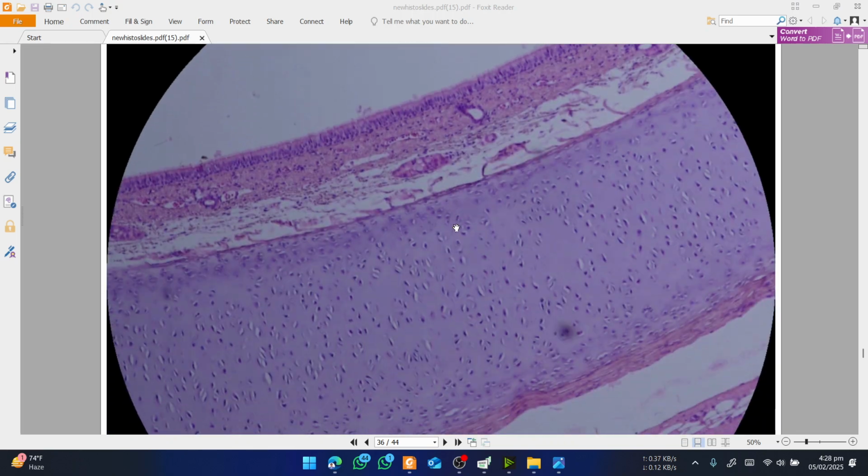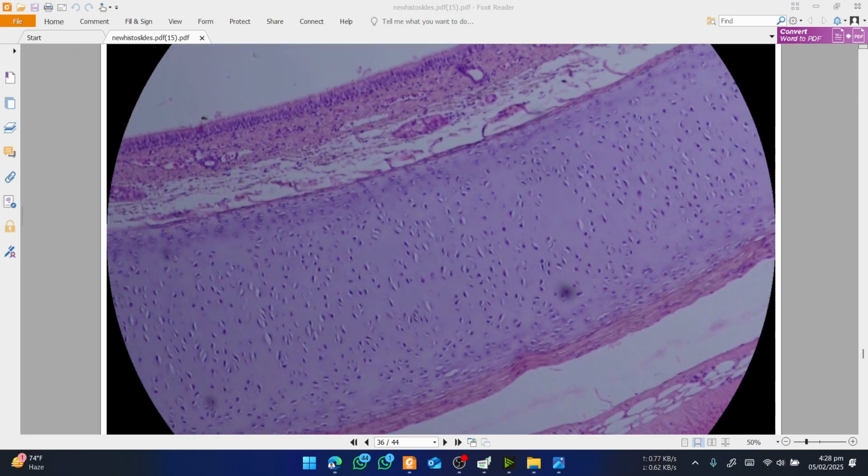Okay, moving on. Trachea. You have studied most of the things before. Trachea will have pseudostratified epithelium on the top that we discussed in the earliest part. It will have hyaline cartilage throughout, and that is the epithelium, that is the mucosal part, that is the submucosal part with glands, and ducts of glands are seen right here. Some glands are shown right here. This is the hyaline cartilage, and that is the dense irregular connective tissue surrounding the outside. So that is the trachea as a whole, and this slide is usually used for pseudostratified epithelium, hyaline cartilage and trachea as a whole.